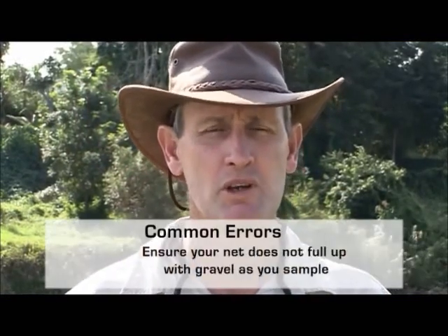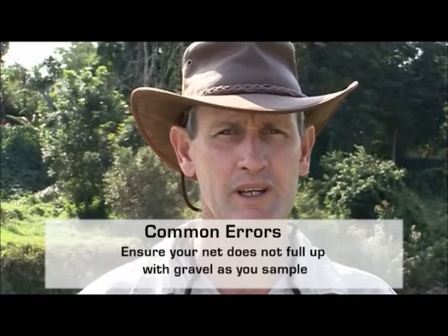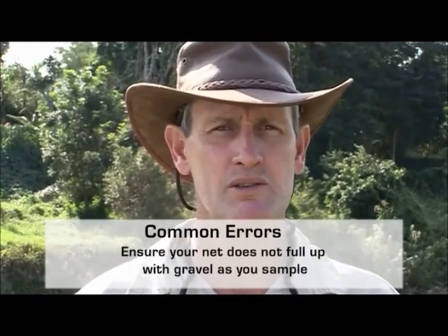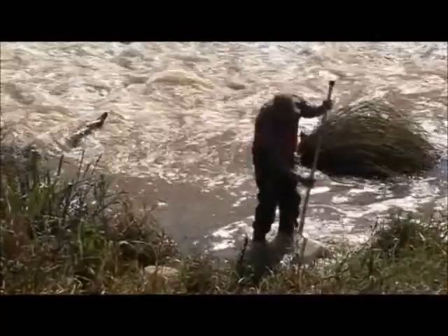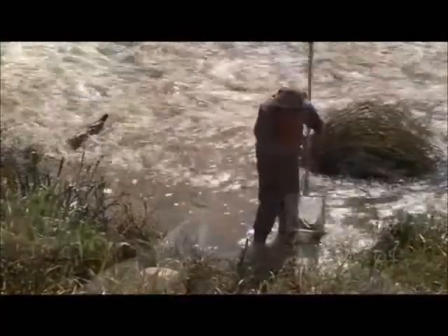Some of the common errors associated with sampling the gravel, sand and mud are firstly to make sure you don't get too much gravel landing up in your net. So the way to do that is to work these gravels vigorously with your boots and allow the heavier sediments to settle out quickly, and then sweep your net through that. And with practice you'll get a feel of that.